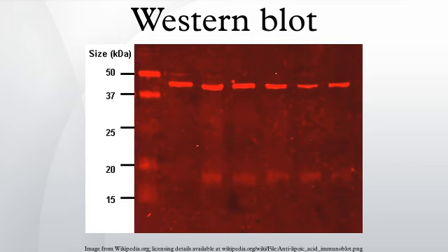The primary antibodies are generated when a host species or immune cell culture is exposed to protein of interest. Normally, this is part of the immune response, whereas here they are harvested and used as sensitive and specific detection tools that bind the protein directly.